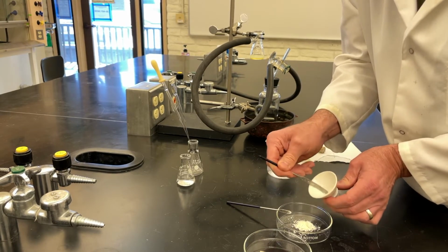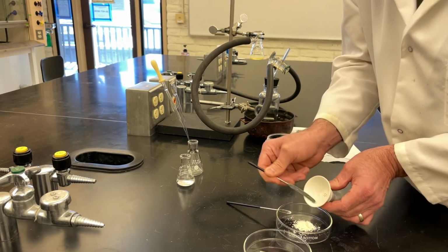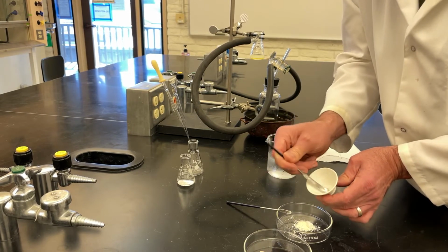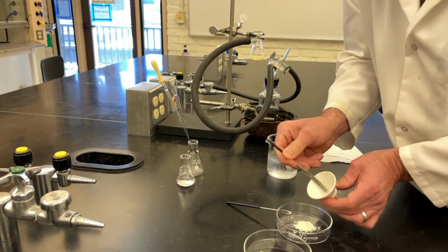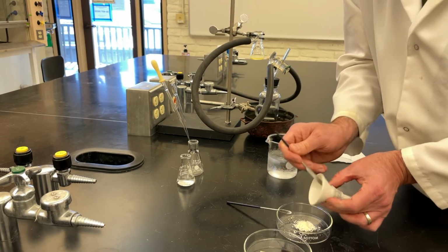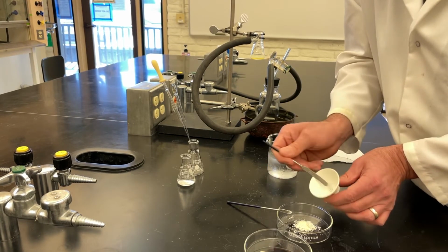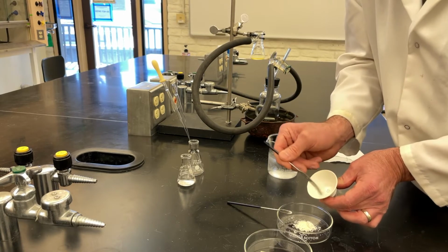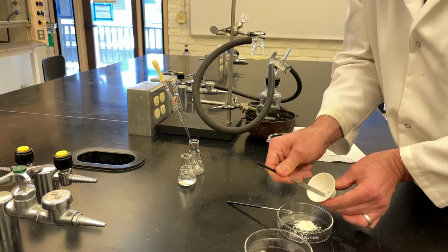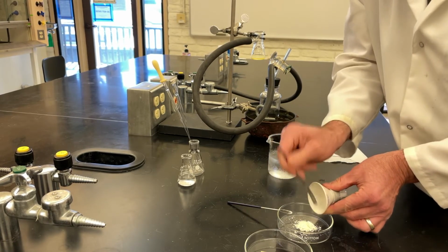One of the things you miss on camera is all of the odors of each one of the compounds and solvents and all the things that we work with. This one has a slight smell that still smells a bit like benzaldehyde, a little bit of an almond smell to it. Not unpleasant and not too strong. I can't say that about most of the things that we work with, but this one's not too bad.